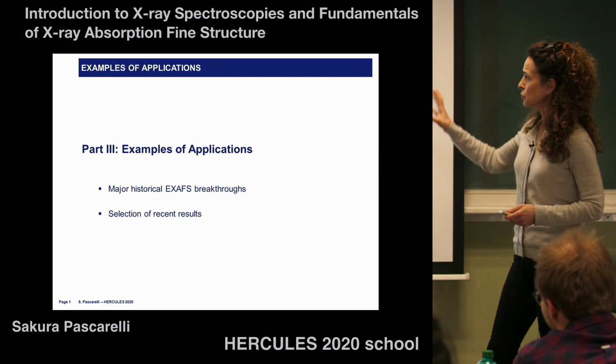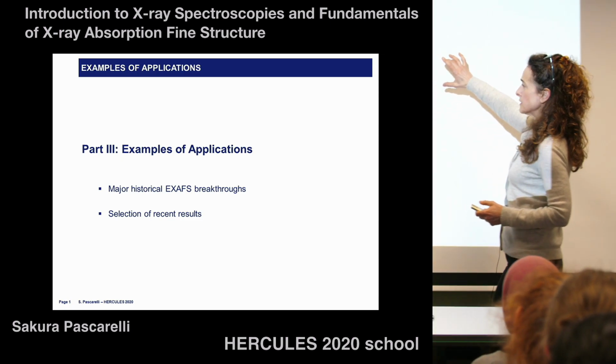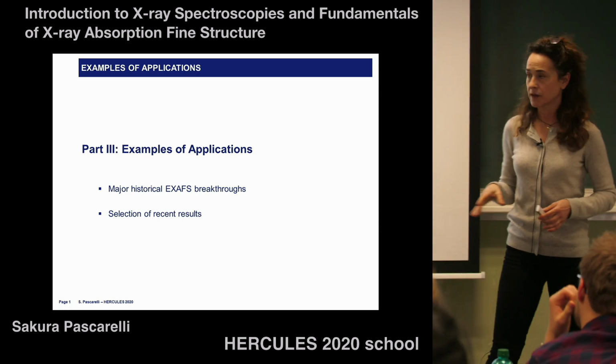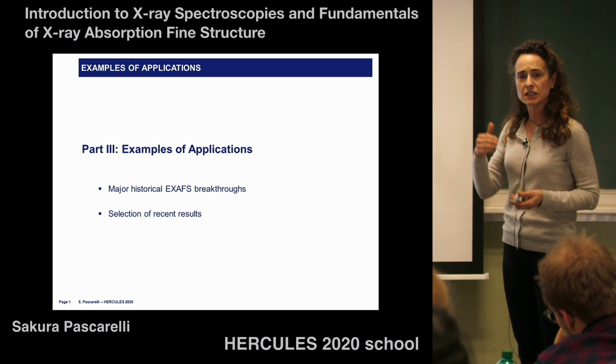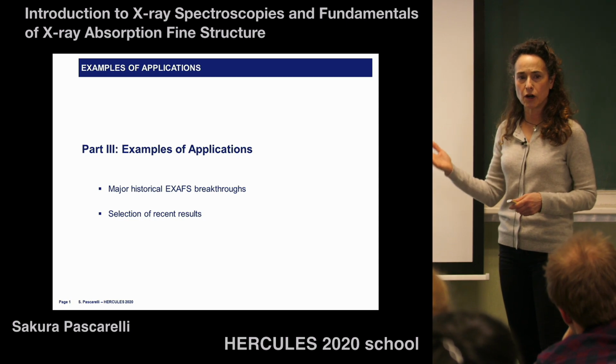So I'm going to show you two types of applications. I'm going to start by showing you three examples of major historical EXAFS breakthroughs. The reason I want to talk about this is because sometimes you lose a little bit the history of how these things have evolved.